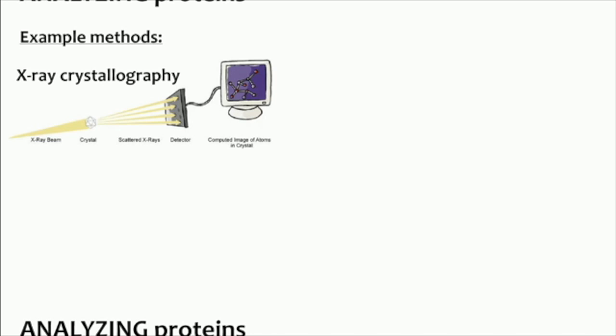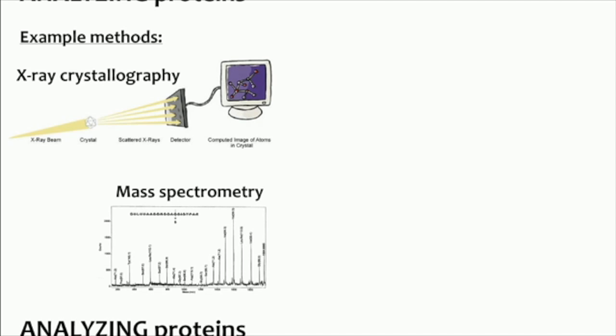To determine the amino acid sequence of a protein, a lot of times what we use is mass spectrometry, where you end up getting a signal that looks like that. Often what you do is digest the protein, chop it up into small pieces, run them through a mass spectrometer, and then you get peaks depending on the mass to charge ratio of each peptide. If the peptide is multiply charged, then you have to divide it by the multiple charges. People who know how this works can interpret something like that and say this is the amino acid sequence of my protein. This is an example: that peptide sequence written out there, you can barely see it, is in single letter abbreviations for amino acids. This spectrum would look like that.